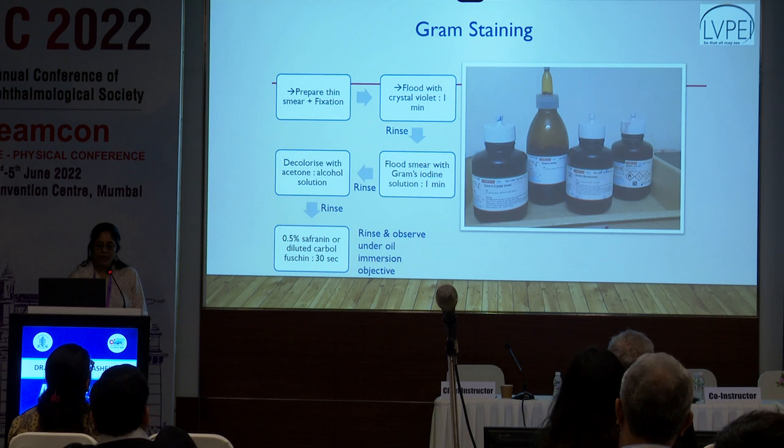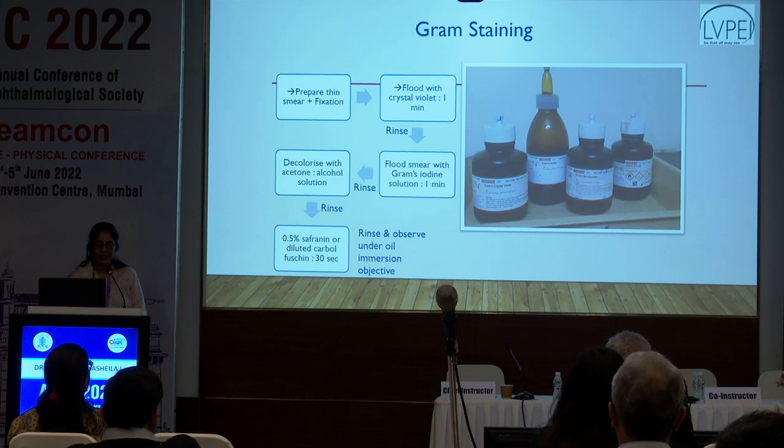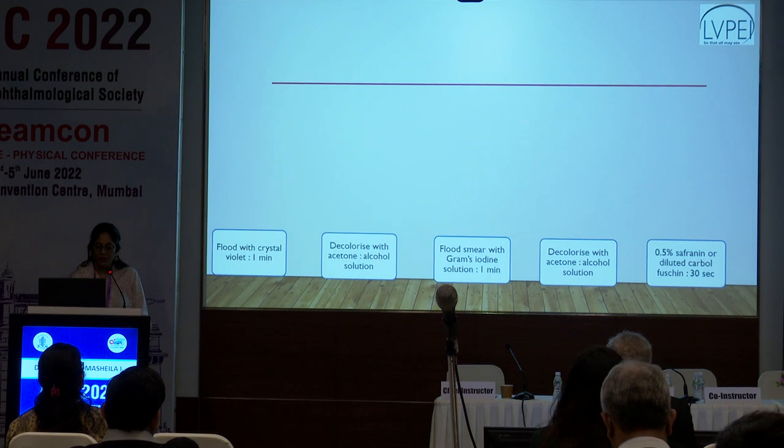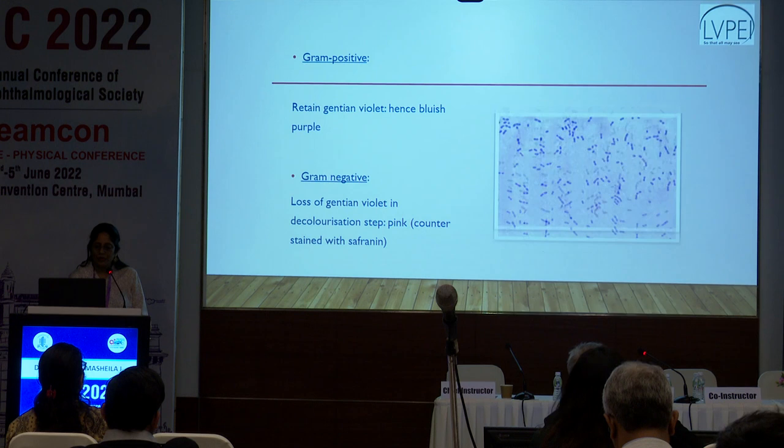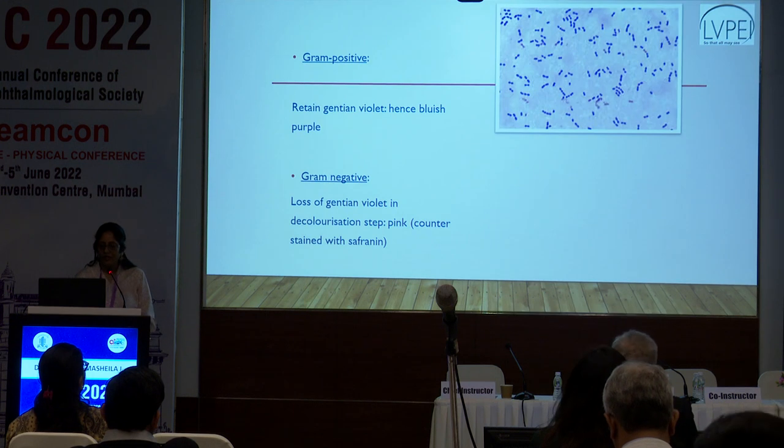I won't go through Gram stain. This is very basic, but it's very interesting. Some of you may recall doing it, at least those who've done cornea training. So it's a very simple way of doing this. I'm not going through it, but the information it gives is very valuable.